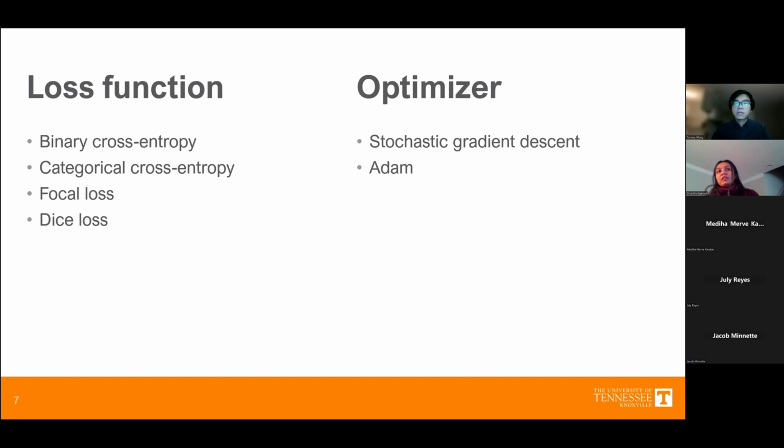Because in the paper that I published, the categorical cross entropy in the UNet did not provide any great result. In fact, it provided more masks to my bubbles, because it is providing a bias against the negative class and supporting the positive class. So it is marking more positive pixels.